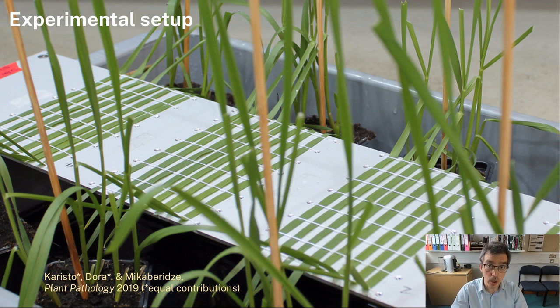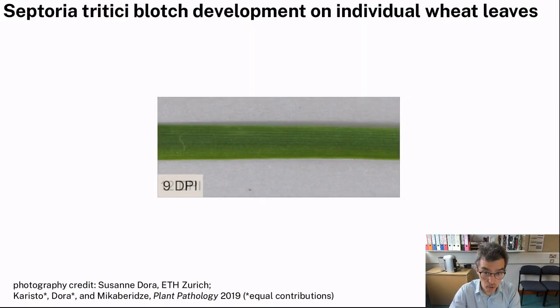And then we inoculated a spore suspension of Zymoseptoria tritici, so sprayed this liquid spore suspension on top of the leaves. So we infected all these leaves. And then what we did was to measure disease progress in each of those leaves using time-resolved imaging, essentially time-lapse photography. So we had resolution in both time and space. And this is what we observed.